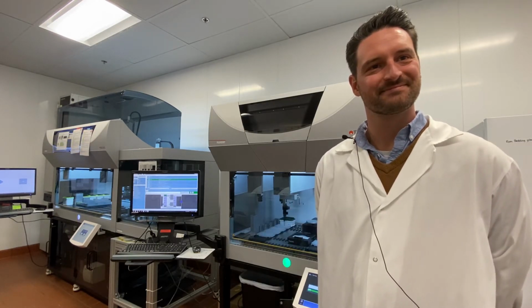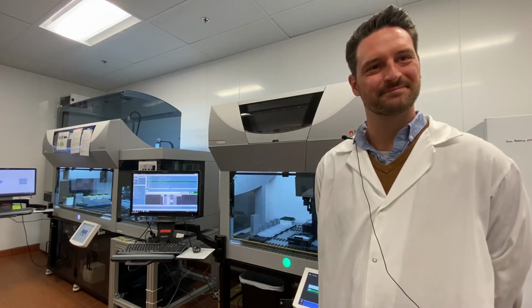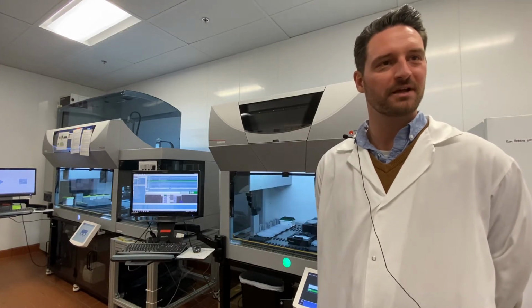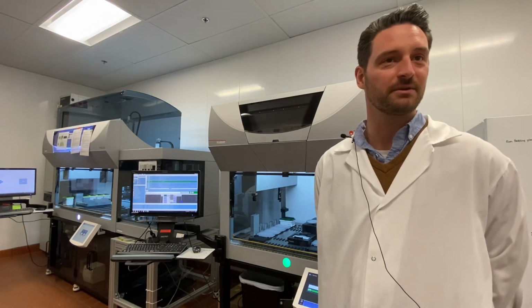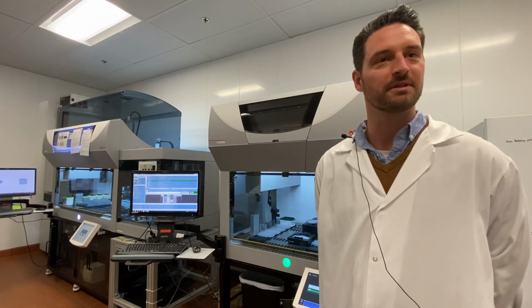And we're here at the ARM Hammer Research and Innovation Lab in Waukesha, Wisconsin. Obviously we've got a lot of robotics around us. So tell us a little bit about robotic automation and how you're using it here in the research lab. The robotic automation platforms that we use help us with a lot of repetitive pipetting tasks that we would otherwise do at the bench. So it helps speed up a lot of things that way.